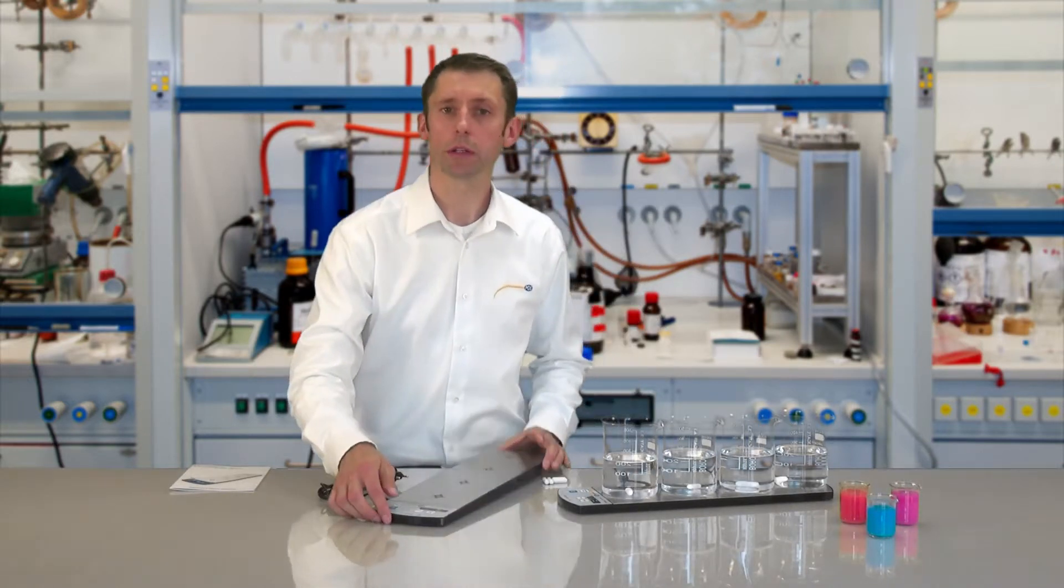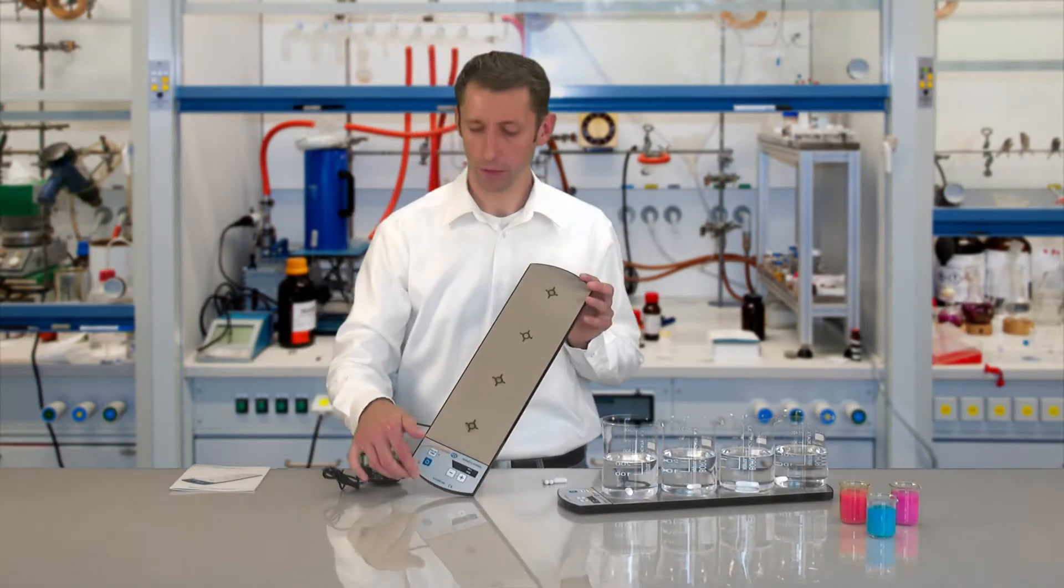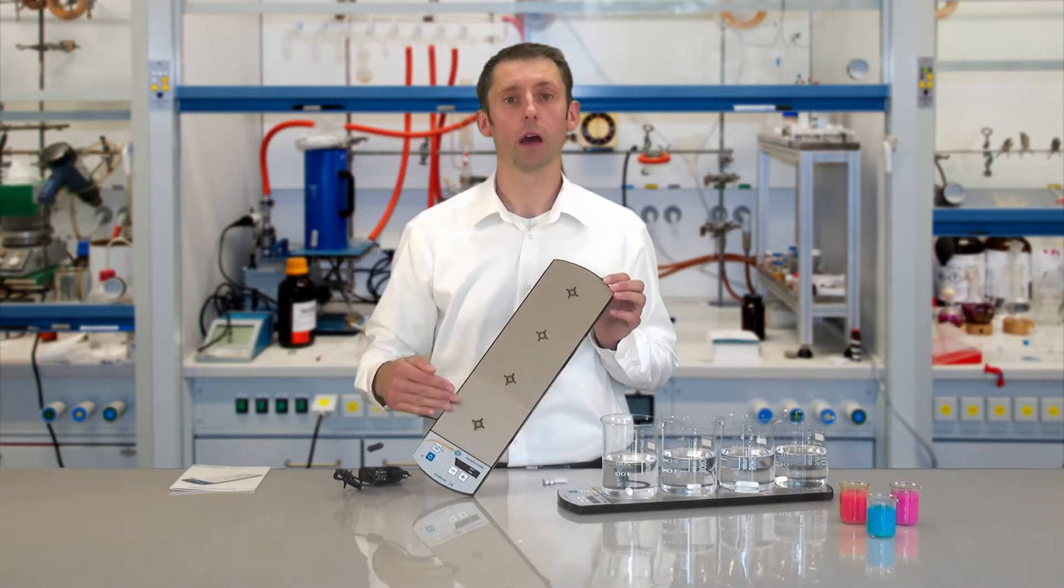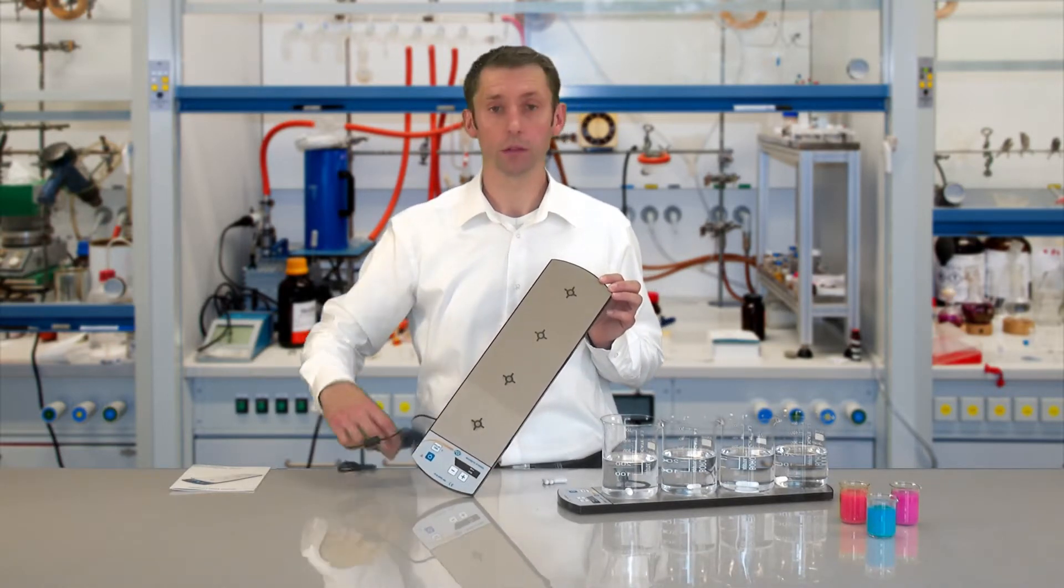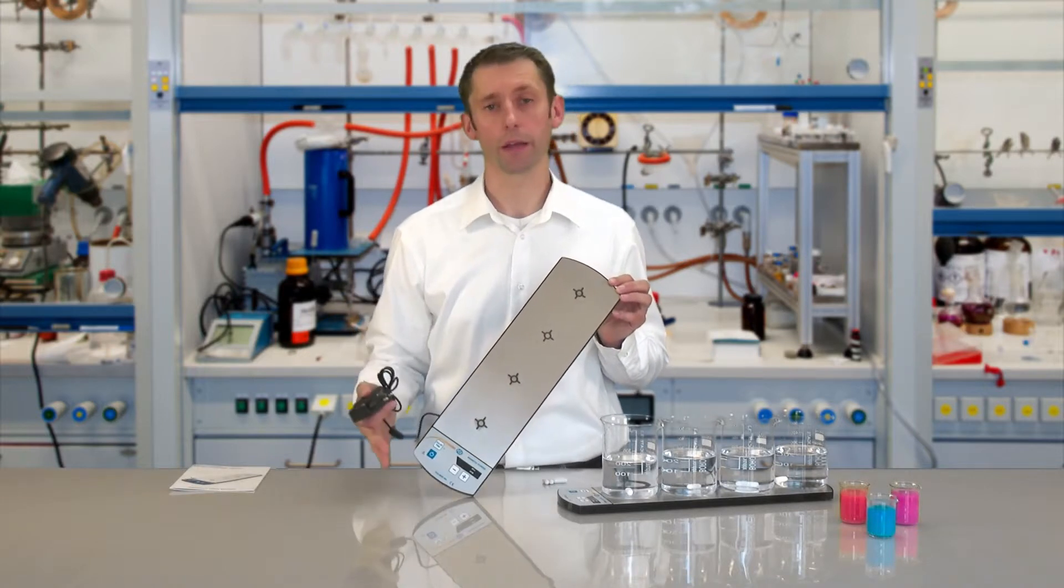The Magnet Stirrer consists of a stable plastic casing with a stirring surface of stainless steel. The connecting cable has a length of around 1 meter.